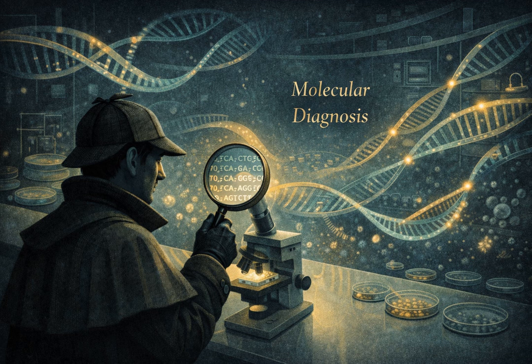Step 2 is annealing. For this, you cool the mixture down pretty significantly, usually to somewhere between 50 and 60 degrees Celsius. This cooler temperature allows your primers to find their target and attach. And primers are absolutely key here. What exactly are they? Primers are short, specific, single-stranded DNA sequences that you, the scientist, have designed. They act like bookends. They are engineered to match and bind to a very specific sequence on the pathogen's DNA that you're looking for, and they mark the starting point for copying. They essentially tell the enzyme, copy the bit between here and here.